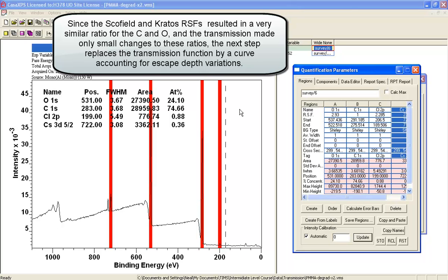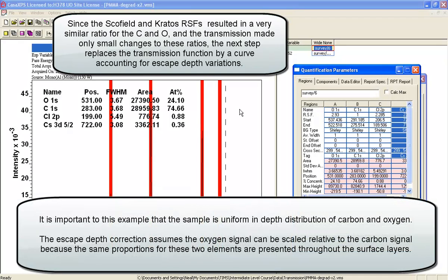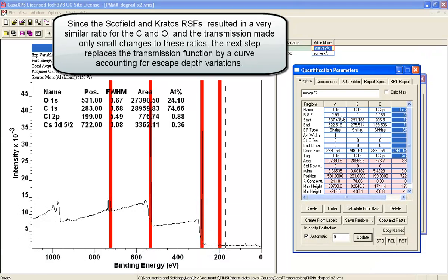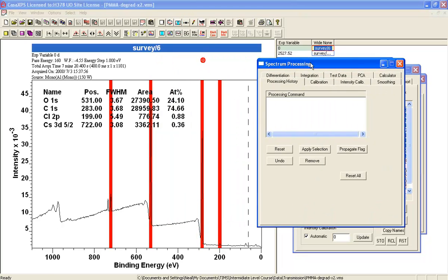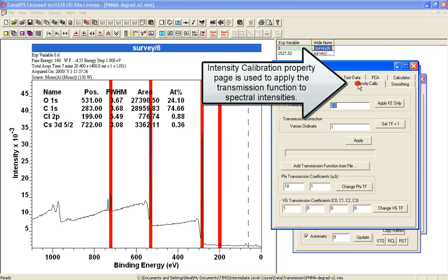Now, the most important change I can make here is actually introduce some physical characteristics that I know about this material. I've got the transition probabilities here, and they absolutely do not know that they were measured from an XPS instrument. So I'm going to use the intensity calibration property page.